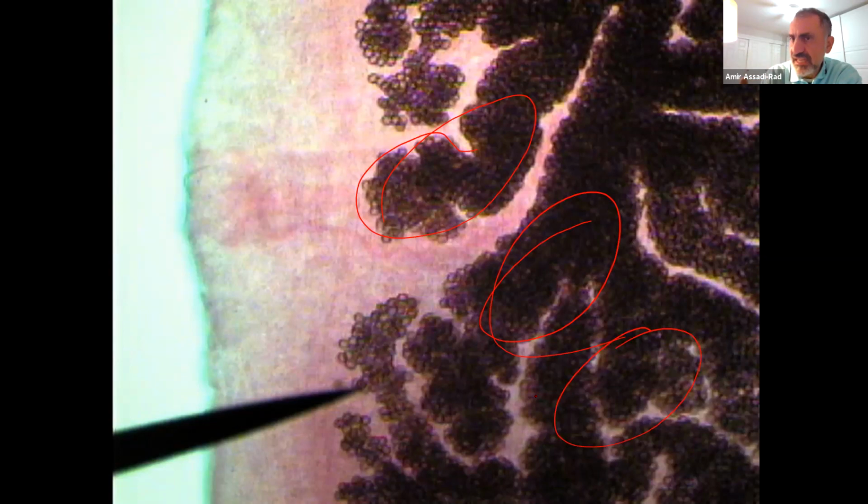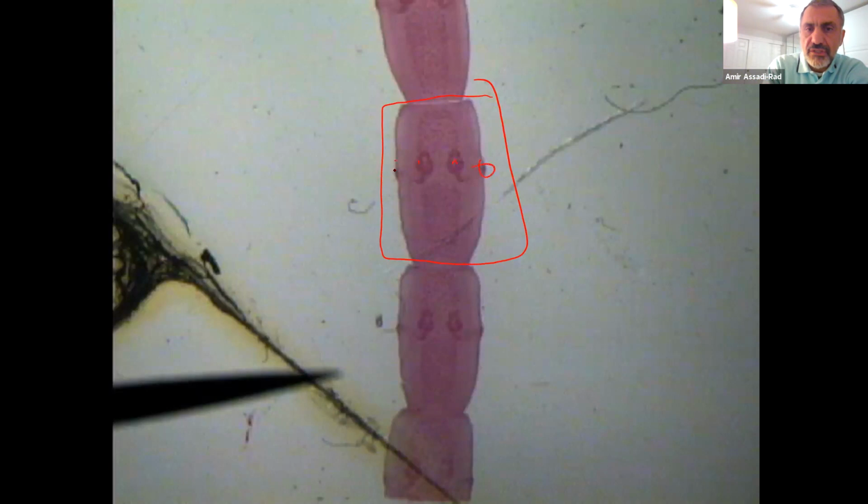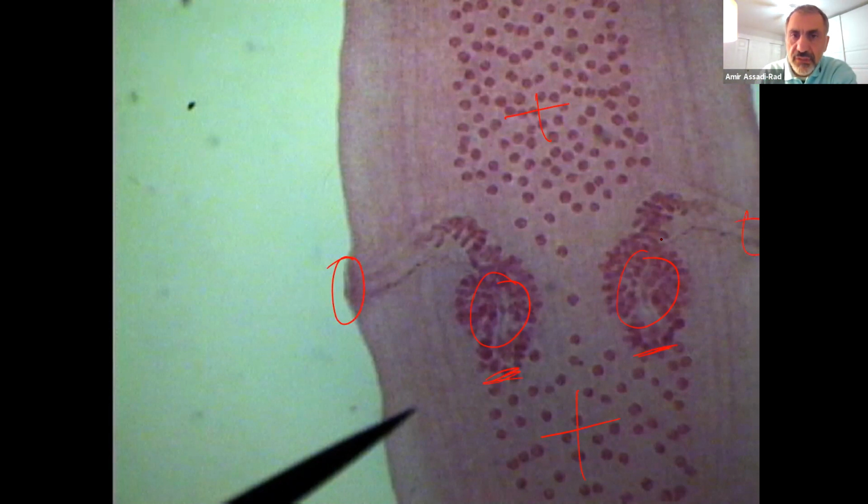Okay, of the Taenia. We're talking about Taenia. Okay, this is the Dipylidium caninum, the dog tapeworm. Look at the proglottids, they look like a barrel. Okay, and then these are ovaries, genital pore, genital pore. So ovary, testes, these are testes, and what else? Yolk glands should be in here, and genital pore right there. So this is the Dipylidium caninum, dog tapeworm.